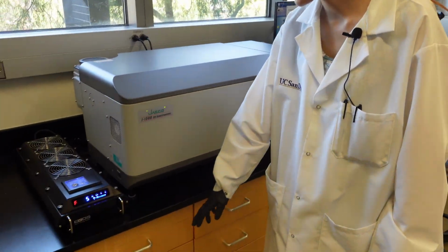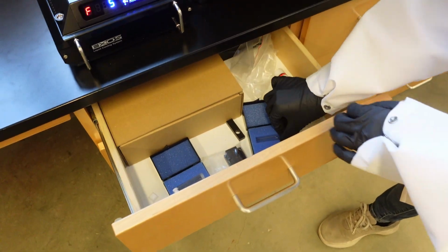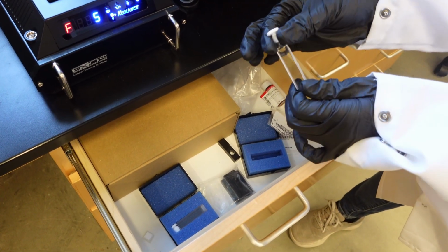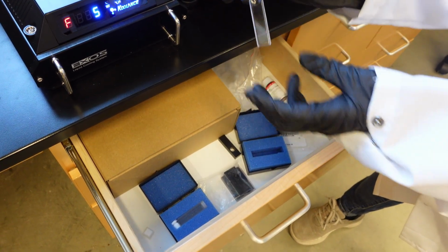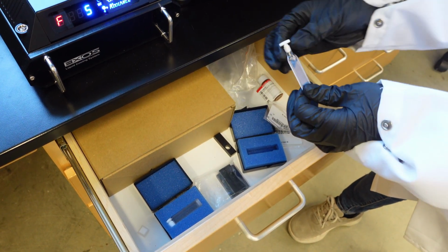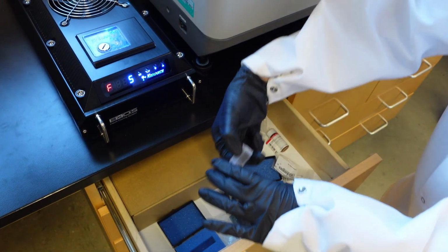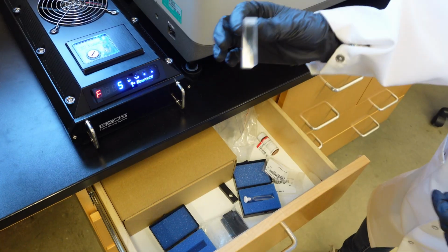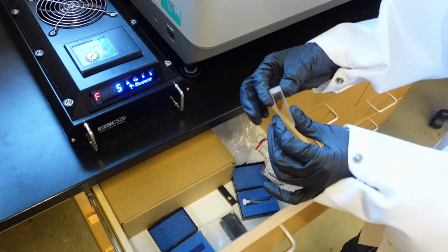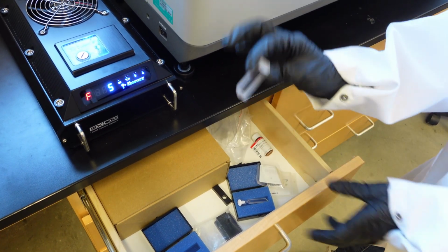Alright, so to get the cuvettes, we've got a couple different options. So we have our smaller quartz cuvette with a 1 millimeter path length. This one you cannot put a stir bar into, it's very small. And so there's this one. And then we also have our 10 millimeter cuvette. So if you are using your own, you're just going to want to make sure it's a strain-free quartz cuvette. And then if you want to use a stir bar for this one, we've got a small one here. So we'll go ahead and prep this guy.